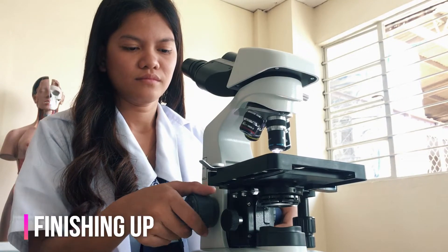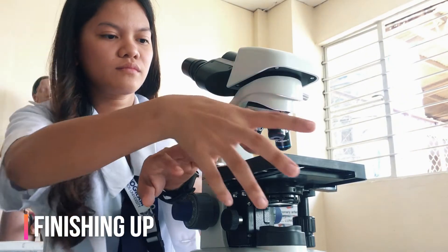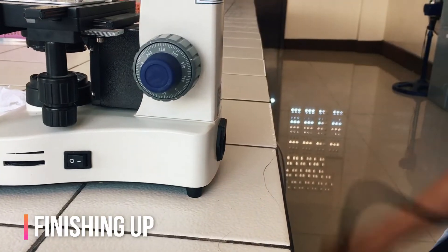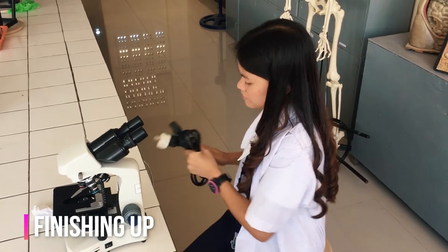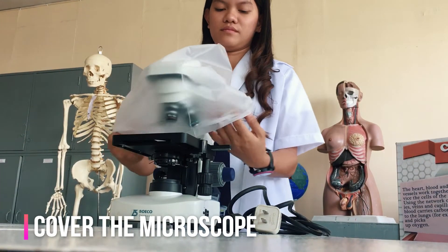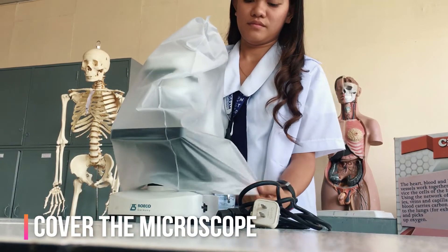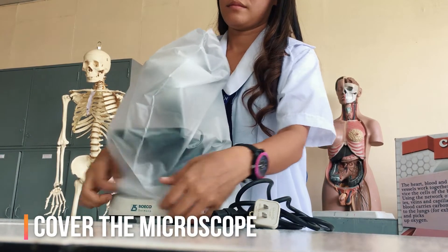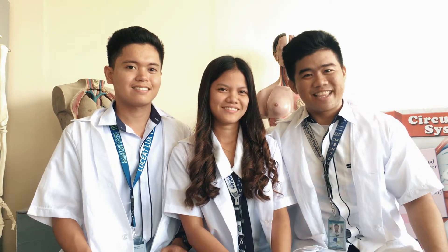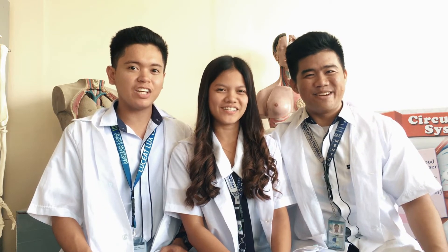When finished, raise the tube or lower the stage. Click the low power lens into position and remove the slide. Unplug the microscope from the power source and secure it properly. Always keep your microscope covered when not in use — dust is the number one enemy. Remember, microscopes are expensive scientific instruments. Handle them properly and carefully, and they will last for many years.